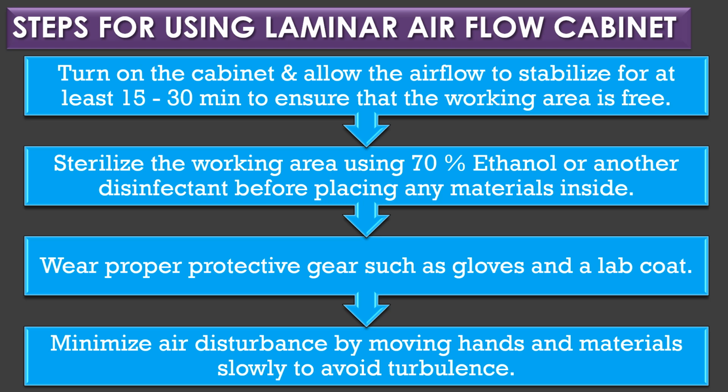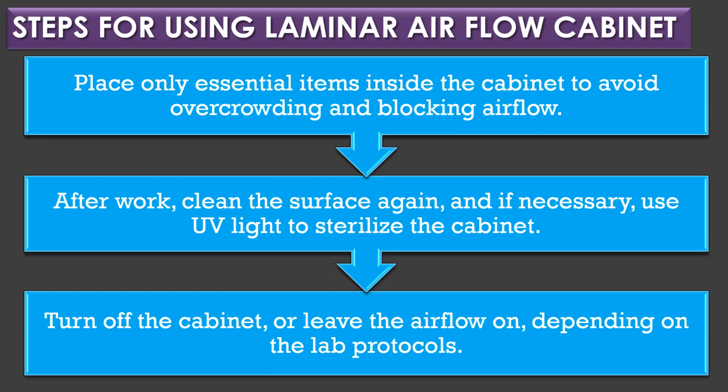In step 3, wear proper protective gear such as gloves and a lab coat. In step 4, minimize air disturbances by moving hands and materials slowly to avoid turbulence. In step 5, place only essential items inside the cabinet to avoid overcrowding and blocking airflow.